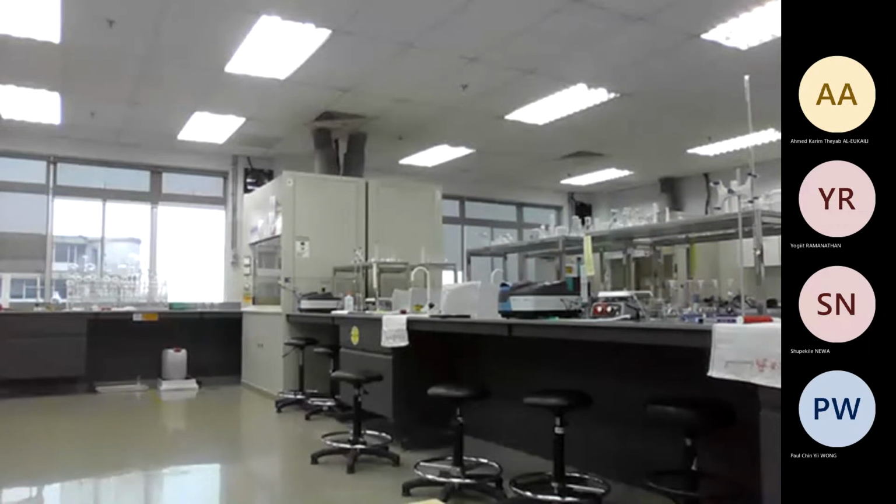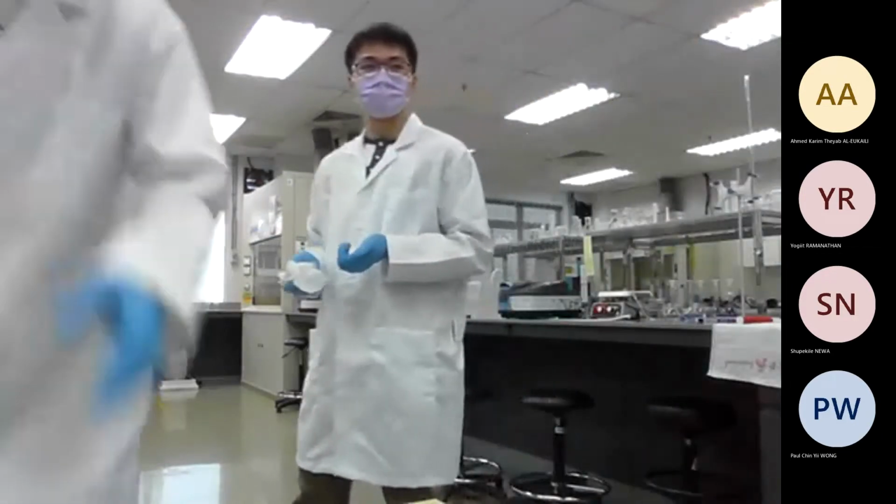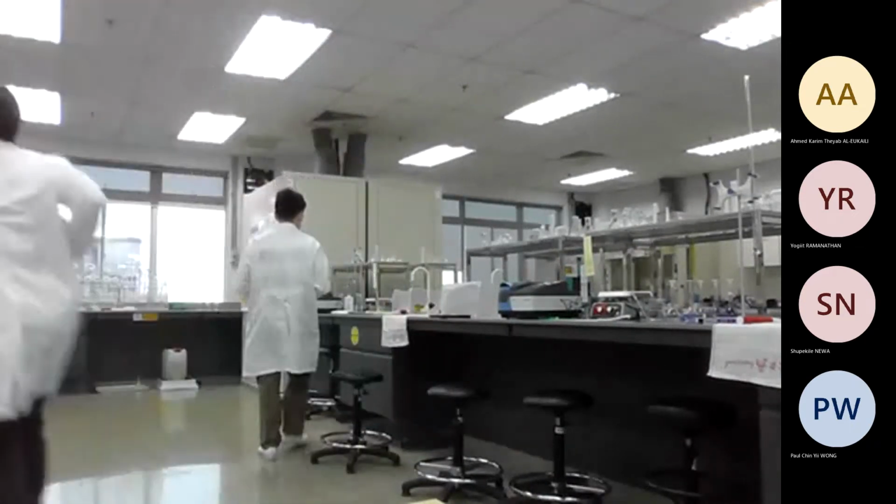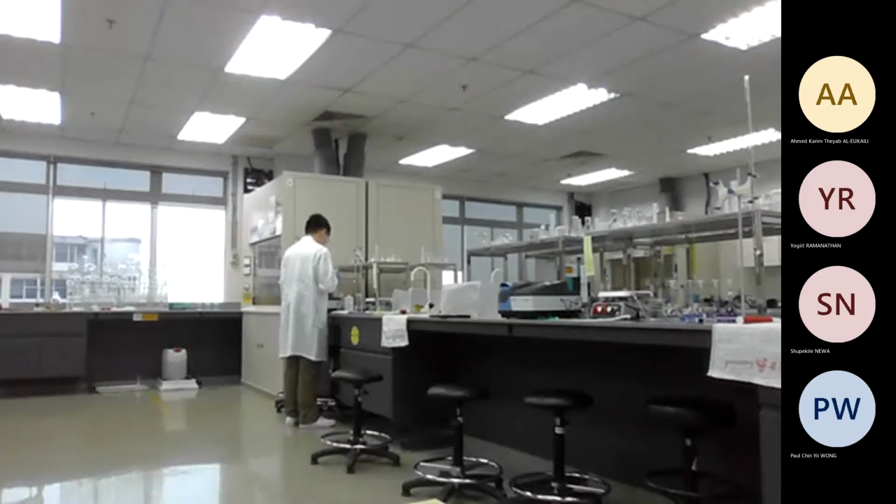But if it were okay until this, and then you invert it, no leaking, huh? No leaking, no. Yeah. If it is just now, my point is, if you are just now this part, and then it leaks for inversion, no problem. But if it was not more or less before, then you have to make it again. You know better.